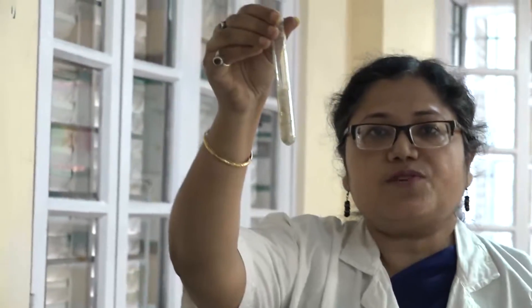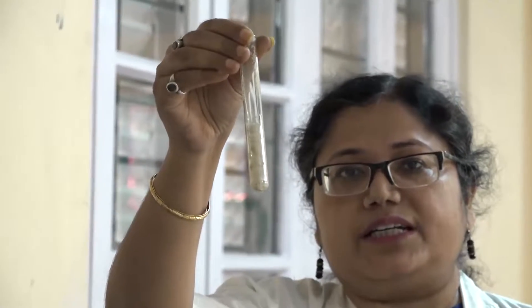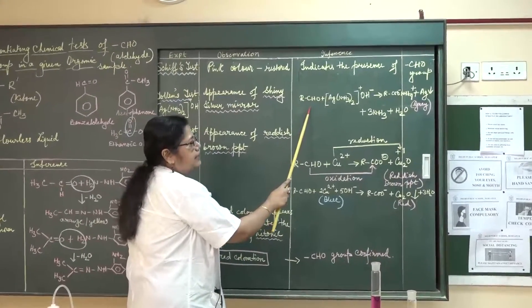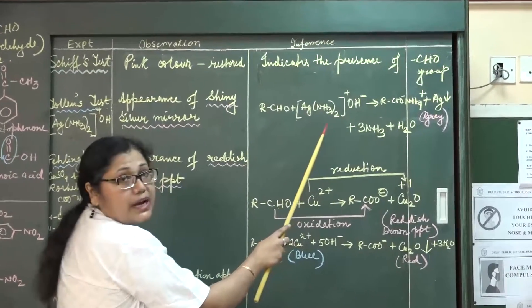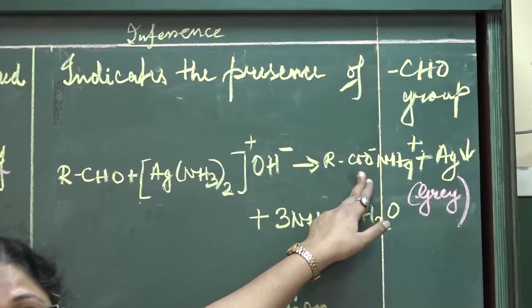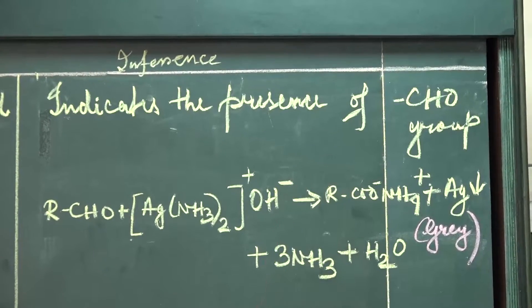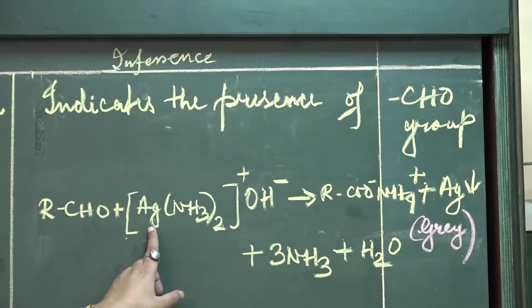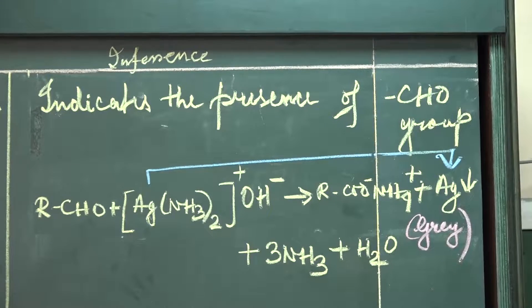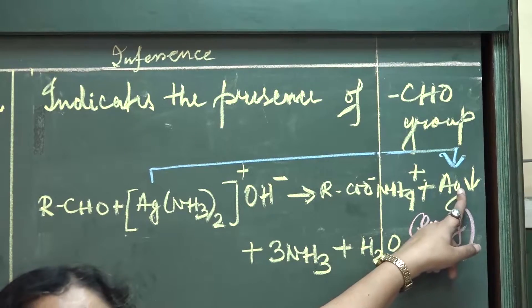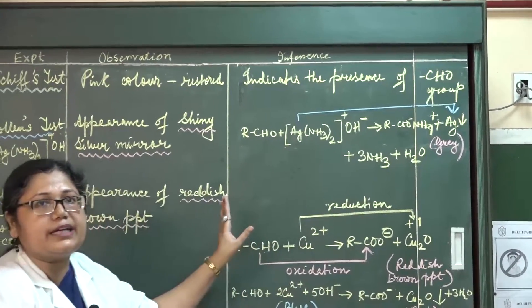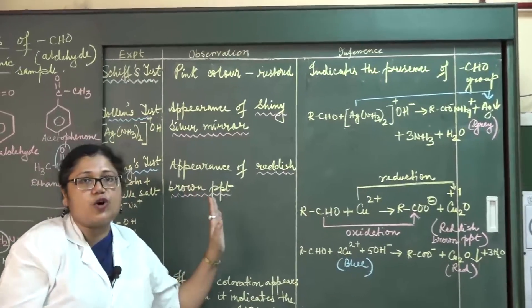You can see the appearance of a silver mirror on the inner wall of the test tube. As Tollen's reagent is a mild oxidizing agent, it oxidizes aldehyde into its corresponding carboxylic acid — changing it into carboxylate ion. The oxidation state of silver goes from +1 to 0, meaning the oxidizing agent is getting reduced. The metallic silver deposit forms a silver mirror on the inner wall of the test tube. This confirms the presence of aldehyde group in the given organic sample. Tollen's test is not given by ketones.